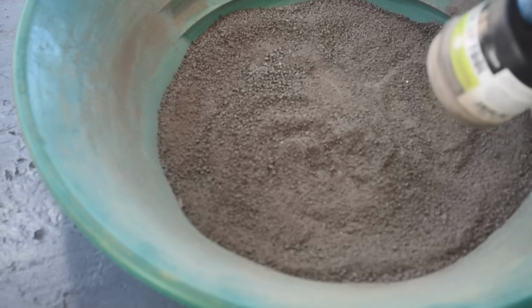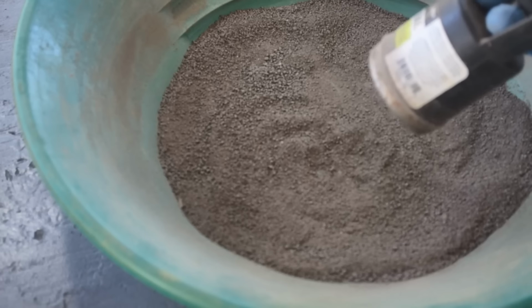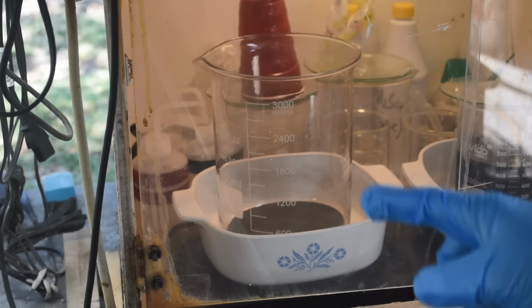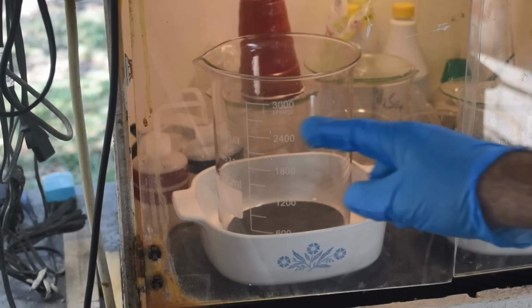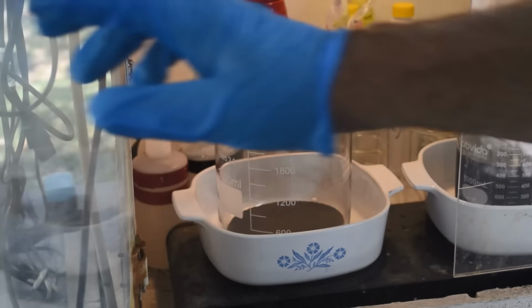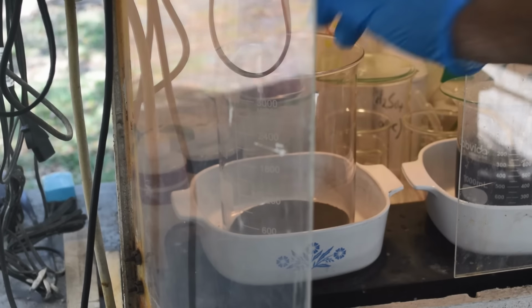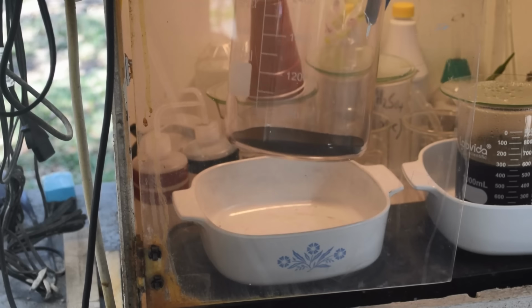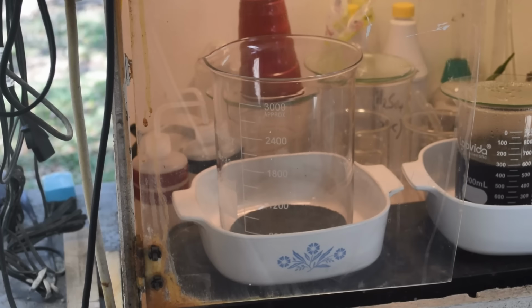So next step for this stuff is to get it into a big beaker, get it into the fume hood, and we'll give it some acid treatments. All right, so I put the powder from the gold pan into my biggest, widest beaker here so that it's a thin layer on the bottom of the beaker, so that will allow the chemicals we're going to use the best chance to get in contact with it. If it was a thick layer, we'd have problems, but it's a nice thin layer.